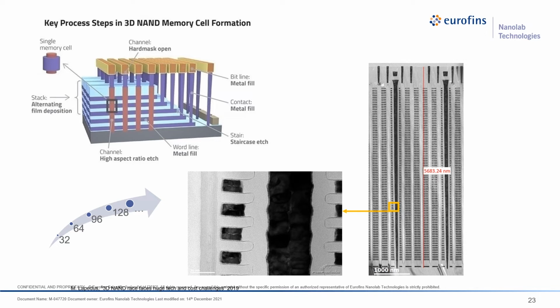Moreover, in the past 5 years, the layers of 3D NAND have been increasing from 32 to 96 to now we have seen some 128 layers on market. And we will see this number of layers keep going up. So as this number gets more and more, this 3D structure is getting more and more complex, and process engineers and materials engineers are facing more challenges to optimize this structure. So to resolve these issues, again, accurate dimensional and elemental analysis are needed.